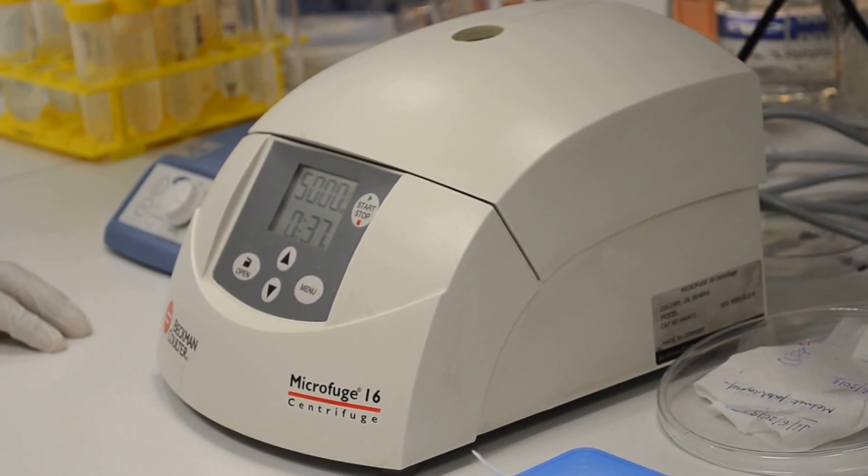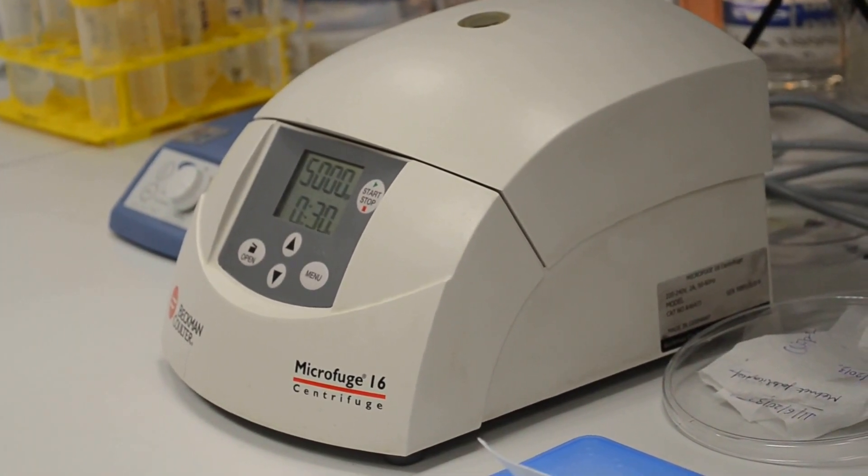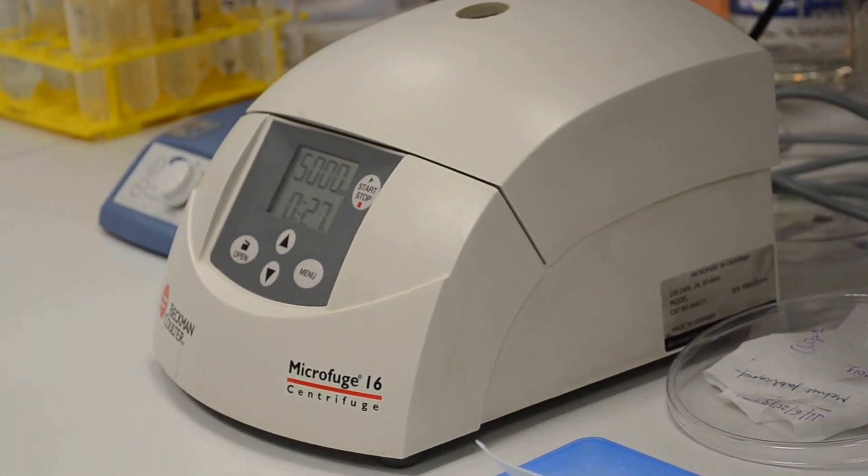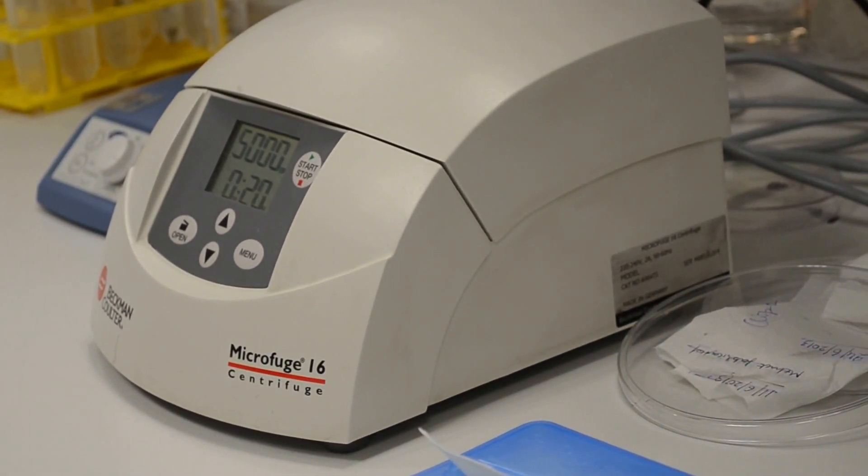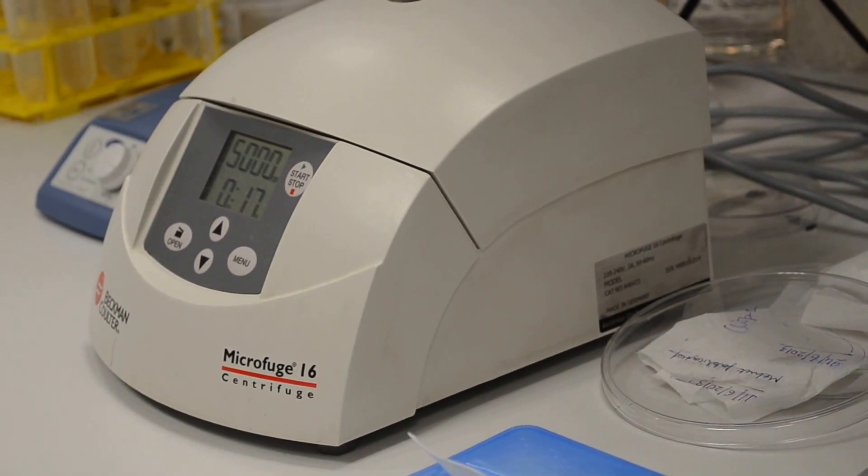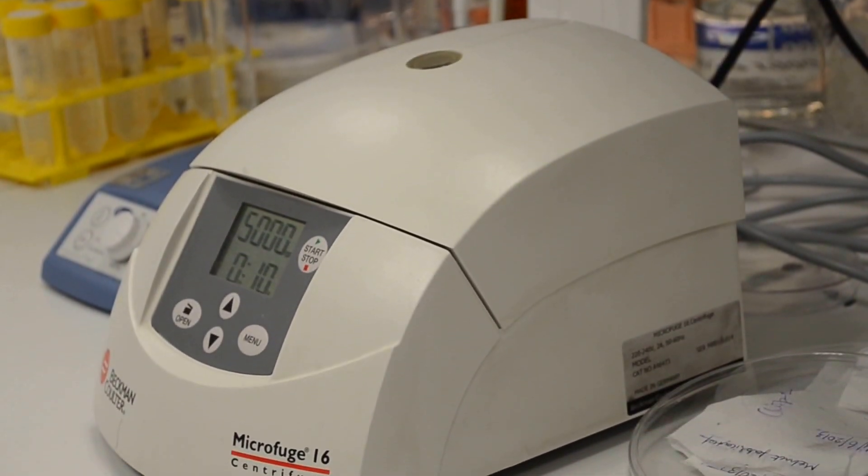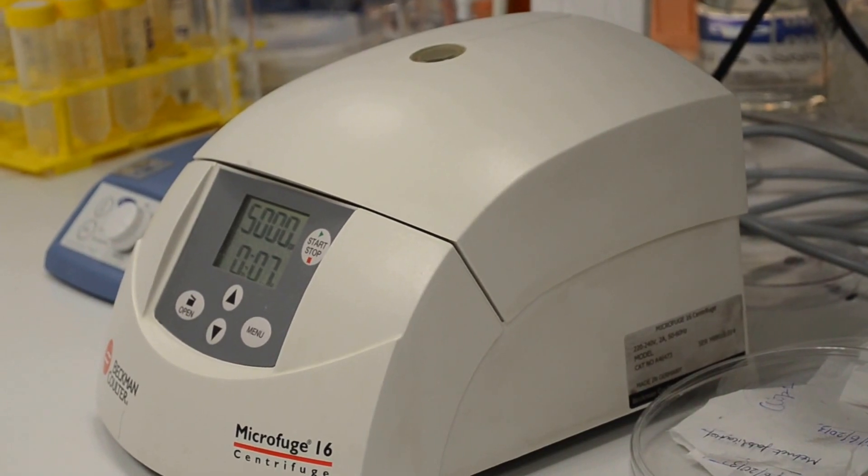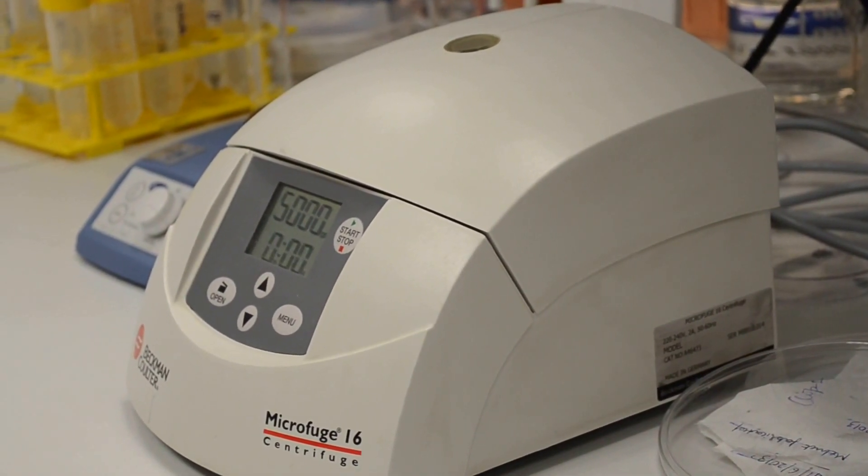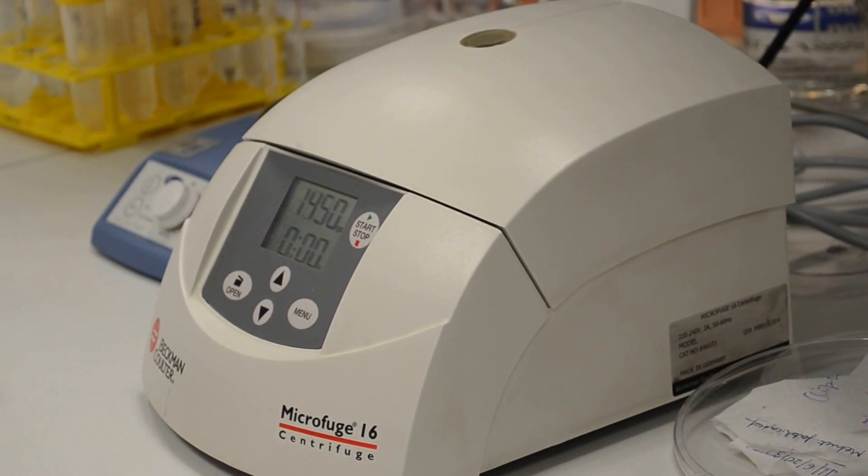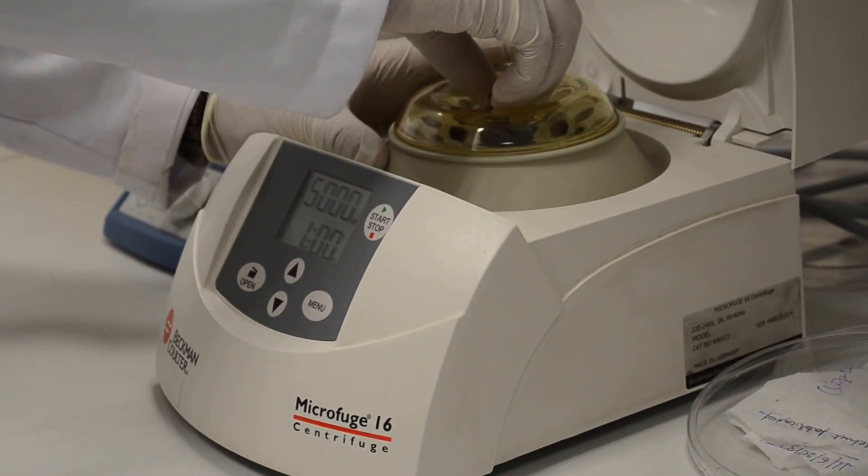And these quantum dots that we are using now have the diameter of about around the same size, roughly about 15 to 20 nanometers. Those quantum dots that have the diameter of less than their pore sizes will get into the porous structure only if the reagent was added. In order to compare the effect of the reagent, we took the test and control samples. The control sample has no reagent; in place of the reagent, same amount of control distilled water was added.